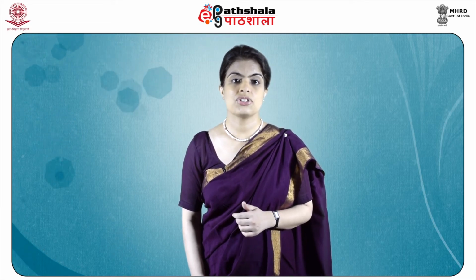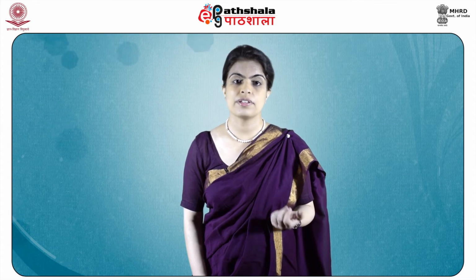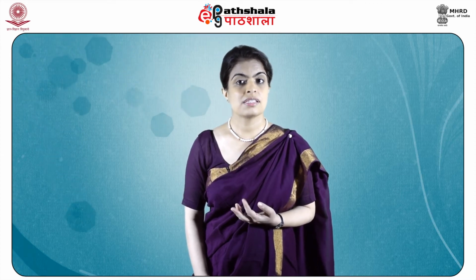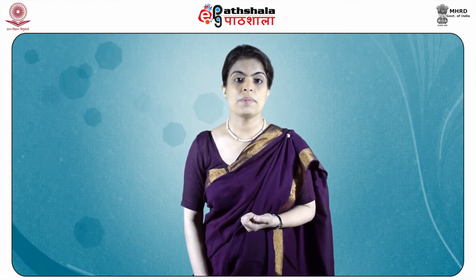Thus, binding on a cation exchanger will be achieved only if the pH of the mobile phase is above the pKa of the charged groups on the resin and below the pI, or the isoelectric point, of the proteins in the sample. For example, in cation exchange chromatography, using a functional group on the solid support with a pKa of 2.2, a sample molecule with a pI of 9.2 may be run in a mobile phase buffer of pH 5.5. Similar reasoning applies for an anion exchange column. In anion exchange chromatography, a molecule with a pI of 5.8 may be run in a mobile phase buffer at pH 8 when the pKa of the solid support is 10.3.